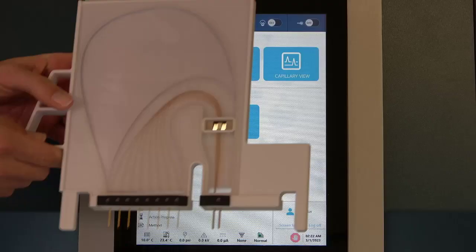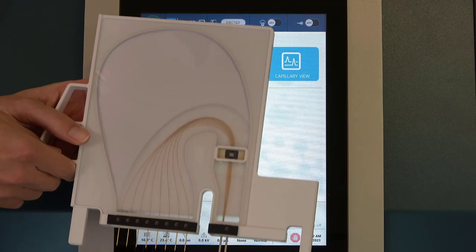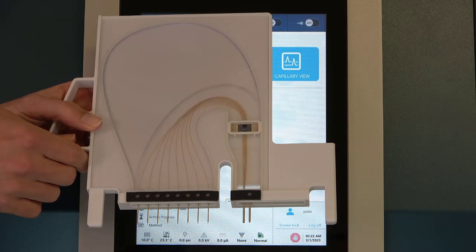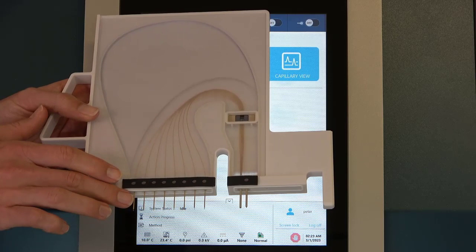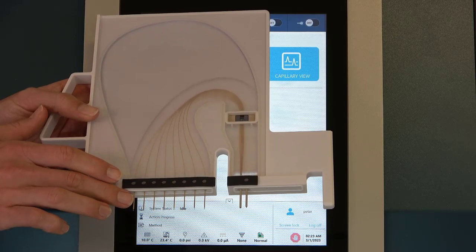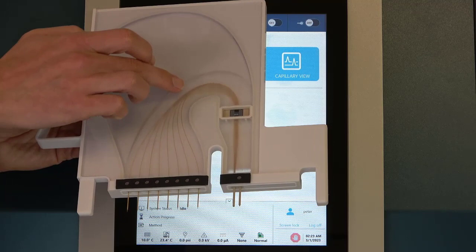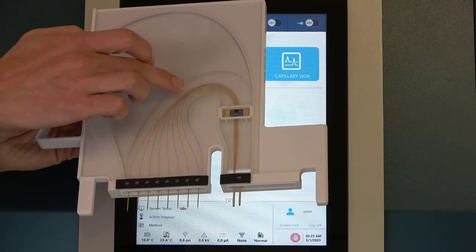Let's look at some of the consumables we're going to be using on our BioPhase 8800. The first thing is our cartridge — this is a completely new design, different from our P100+, and this is what enables all of that high throughput analysis. The BioPhase cartridges are all pre-assembled, everything just comes in a box ready to go. All eight capillaries are on the inlet side, each with its own individual electrode. Each capillary is going to rinse and electrophorese independently of each other.